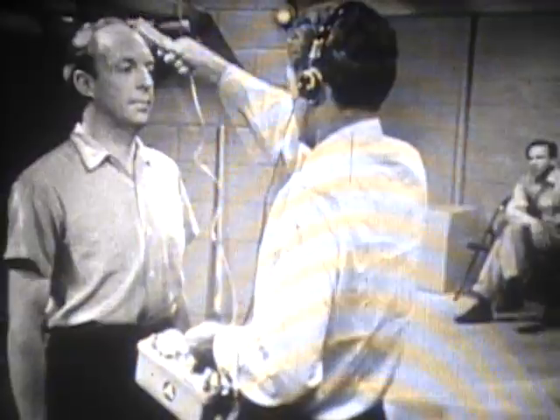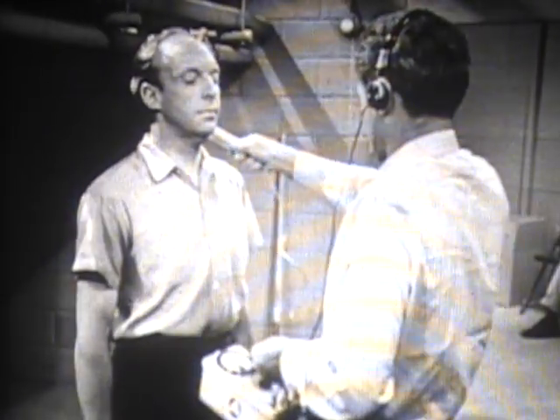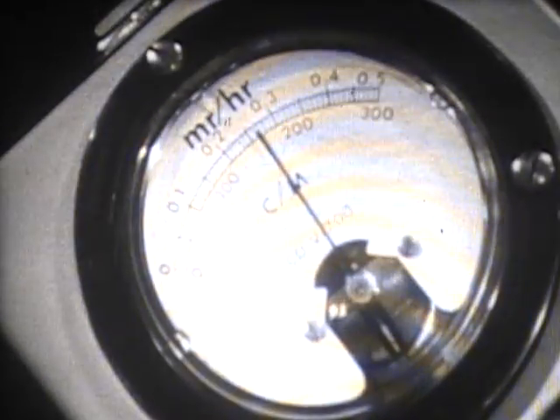From the shoe, the probe goes back up to the head, and down the other side of the body, following exactly the same procedure.